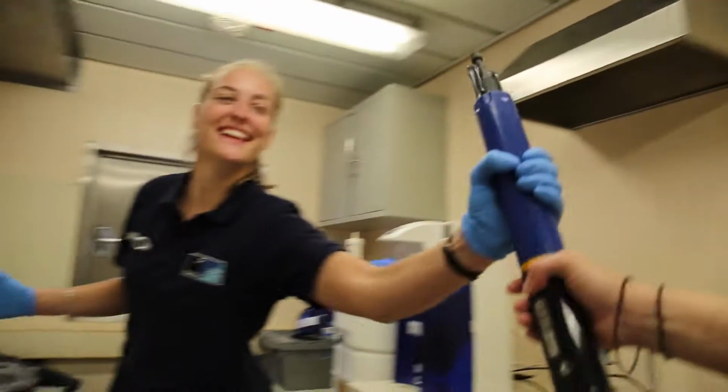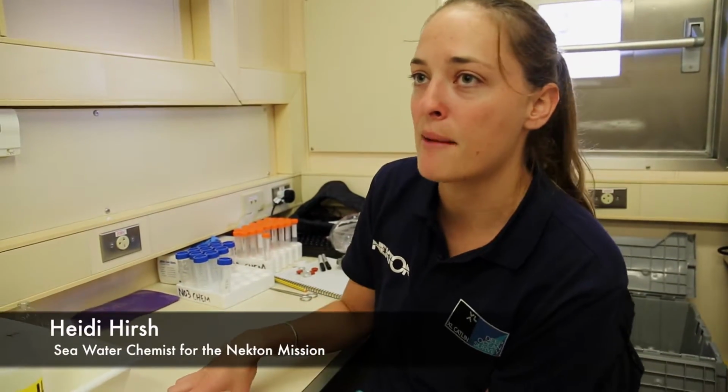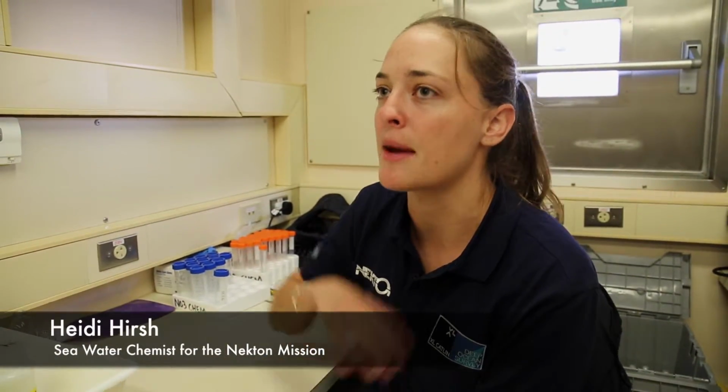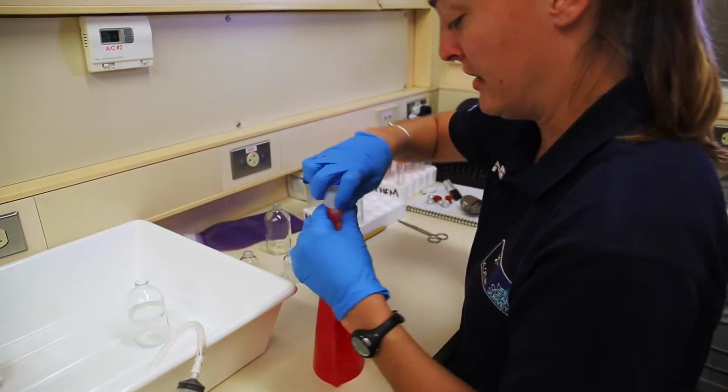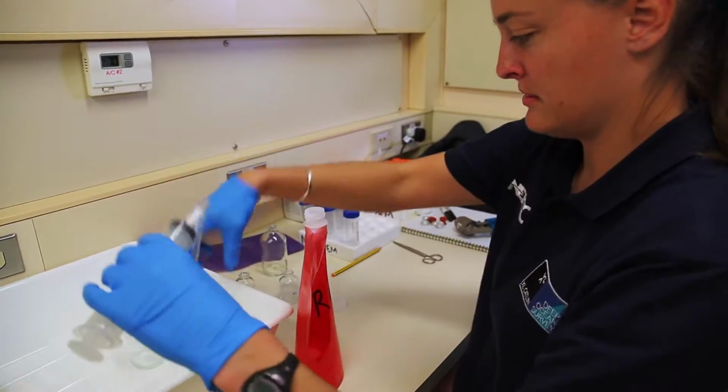So far I've been getting water samples from the tech diver team, and I try to bring them back to this lab immediately to preserve them, because the temperature changes can actually change the chemical composition of the water samples. And so I come back and subsample for the carbonate chemistry, so I have glass serum bottles to do that.